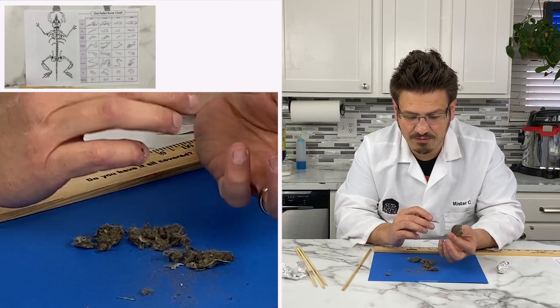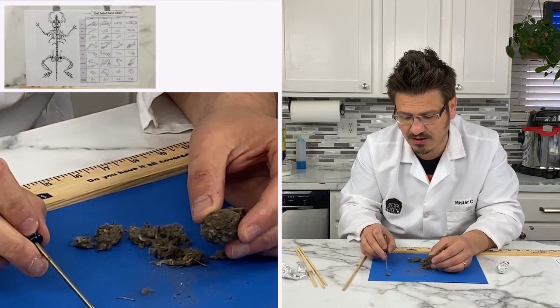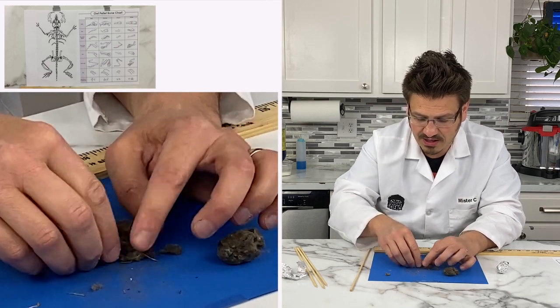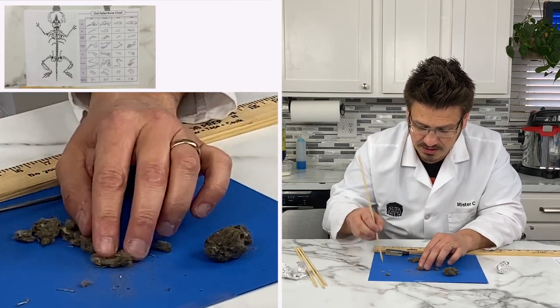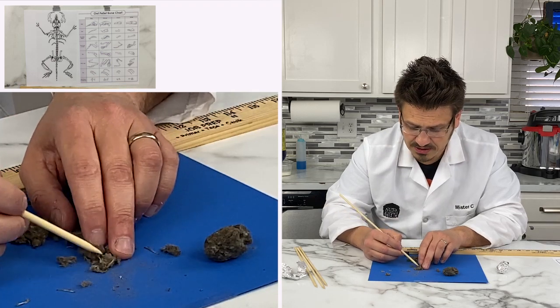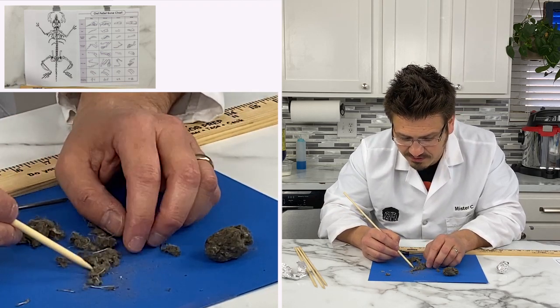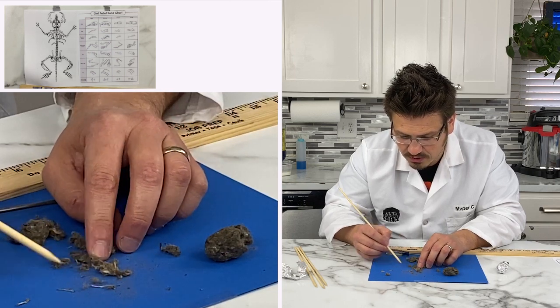What I think, maybe we might just get lucky, we might have another skull over here. That's a small little skull. That's telling me that that bird, maybe it was small, but that was a huge pellet. It really was. So we've got some other bones here. I'm hoping we can find some vertebrae here soon. They're so cool.